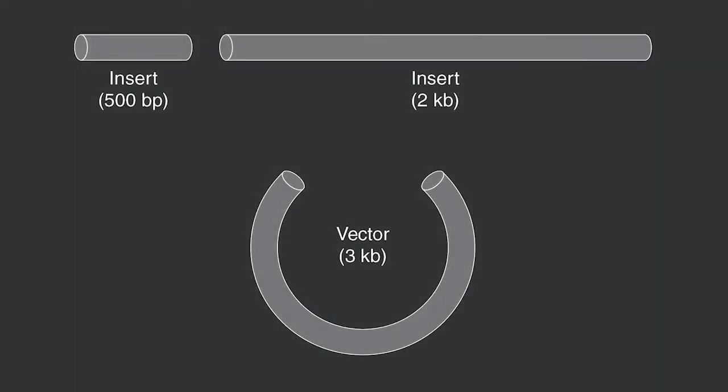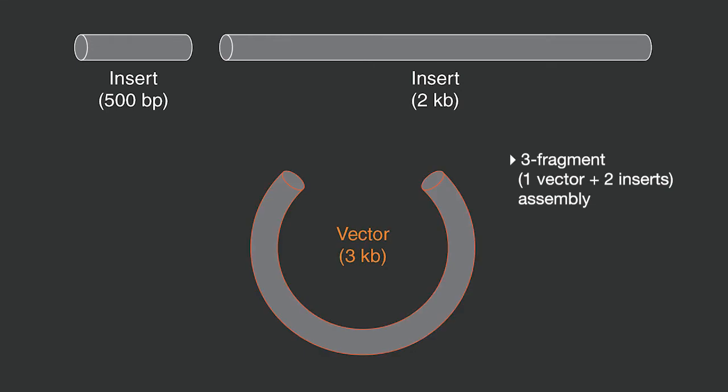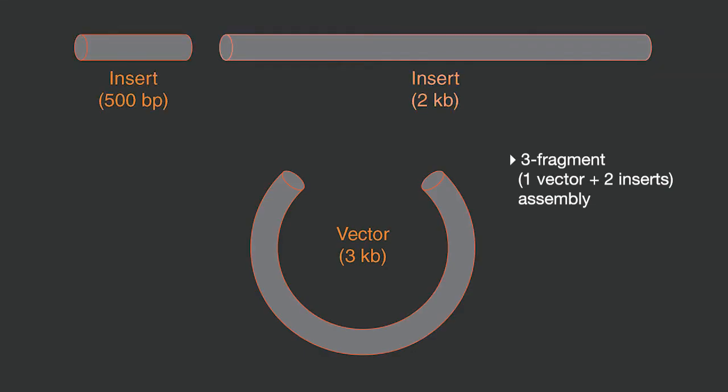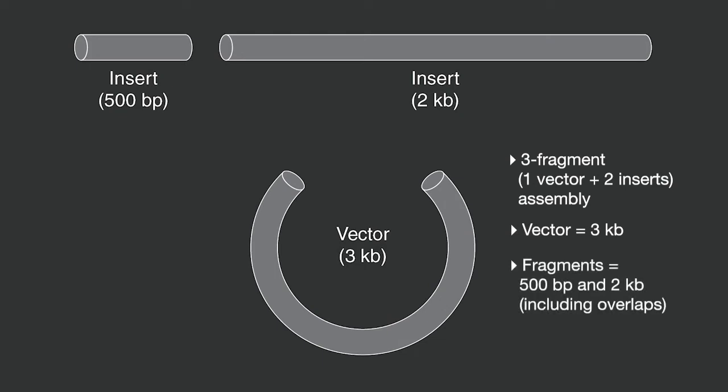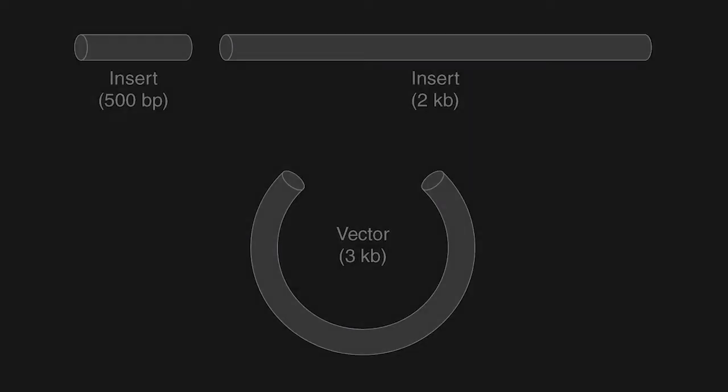In this example, we demonstrate a three fragment assembly, one vector fragment and two insert fragments. The linearized vector is 3 kb in length and the insert fragments are 500 base pair and 2 kb, including the assembly overlaps.